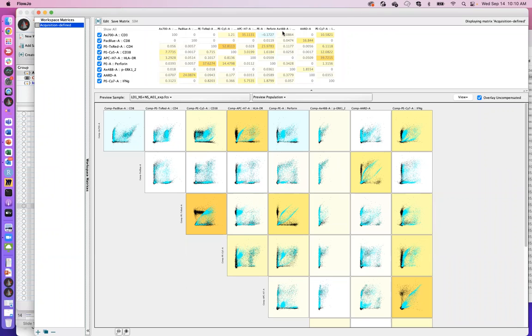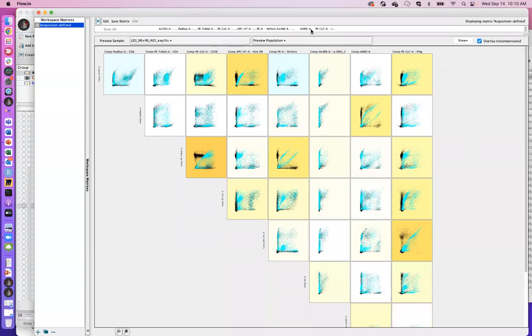Now, normally I don't pay too much attention to the table values because, again, it's more about inspecting the visual here and understanding what is going on with the compensation. So for that, I normally pay attention to this series of plots that you see down below. We call the entirety of these plots an n by n plot because what is being presented here is every 2x2 color combination that is present in the data set.